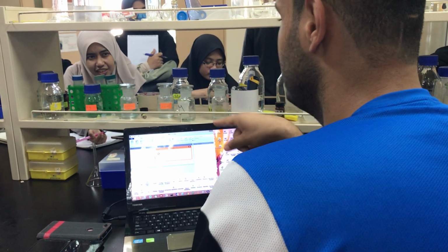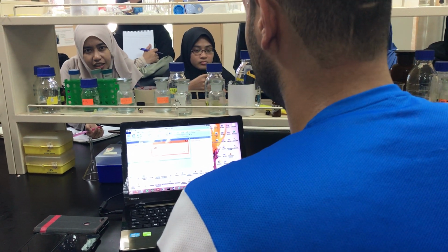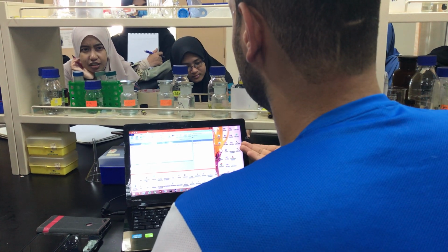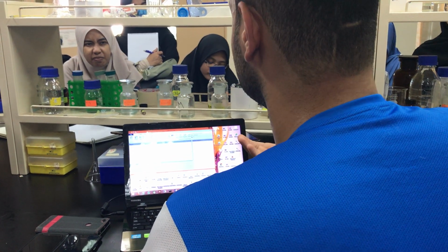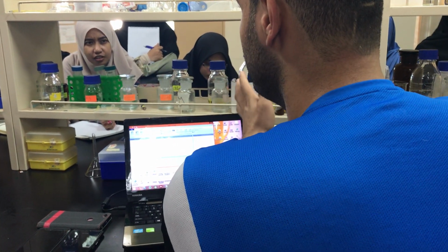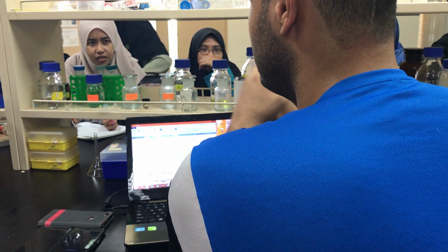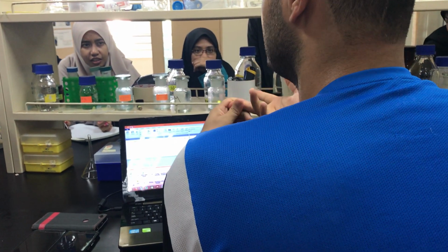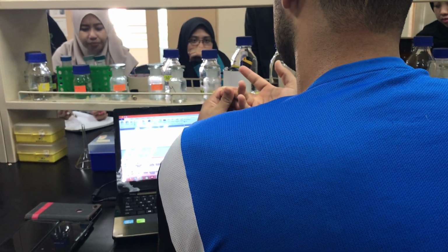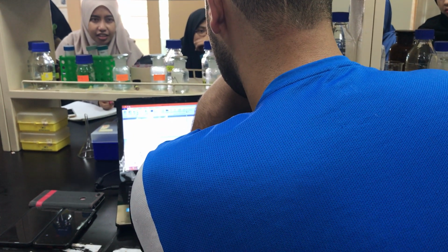But in this case, in the beginning, the software rejected it. It said it was not able to run the data. There's another option, which is that I can give the software the component difference. There are two options, but usually if you want to publish papers, you have to let the software predict the difference. But just for practical purposes, I give the software the components, the difference among the samples. I will show you here.